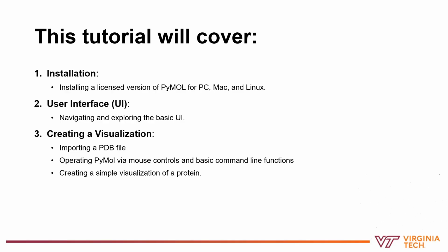This tutorial will cover how to install a licensed version of PyMOL for PC, Mac, and Linux, how to navigate and explore the basic user interface, and we will walk through creating a visualization, including importing a PDB file, aka the rendering, how to operate the software via mouse controls and basic command line functions, and creating a simple visualization of a protein.